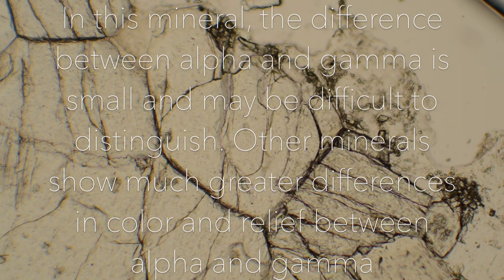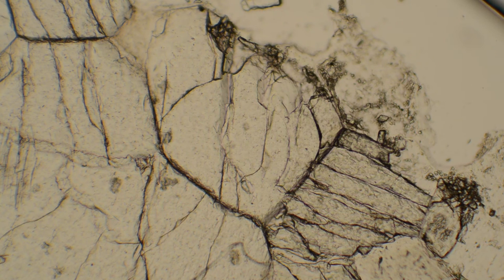In this mineral, the difference between alpha and gamma is small and may be difficult to distinguish. Other minerals show much greater differences in color and relief between alpha and gamma. For an example where this is relevant, watch the linked video on how to fully characterize a mineral grain. In this example, I also go over how to characterize along beta.